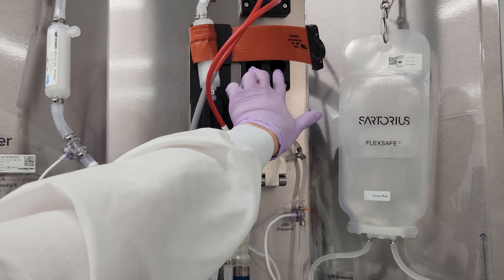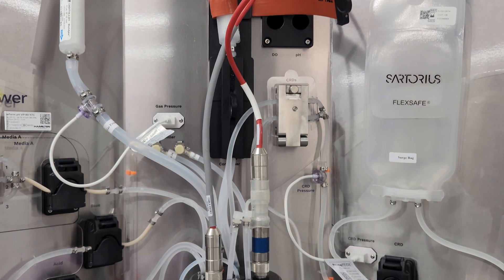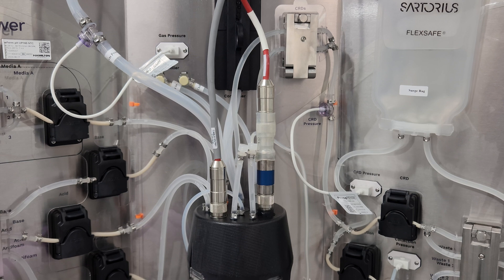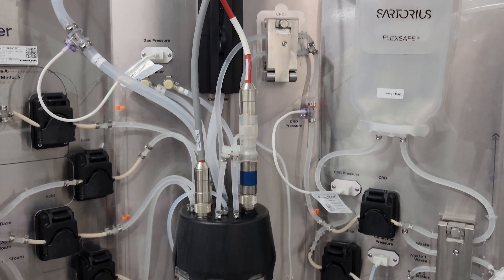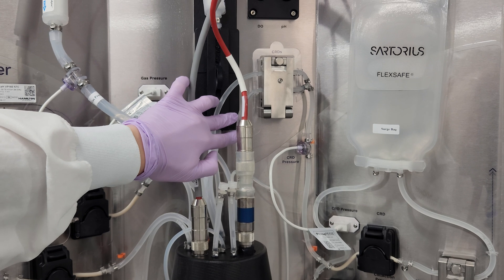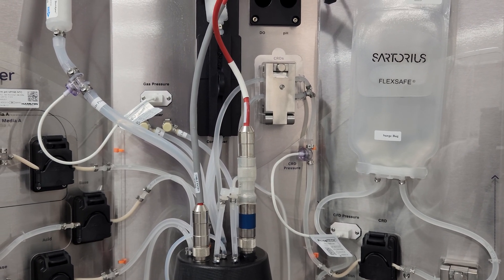Over to the right of the condenser are the connectors for the pH and dissolved oxygen probes, which simply screw into the single-use sensors built into the head plate of the bioreactor. Below these connectors, there's another set of automated valves, which control the flow of fluid from Sunflower's proprietary in-vessel perfusion devices called cell retention devices, or CRDs.